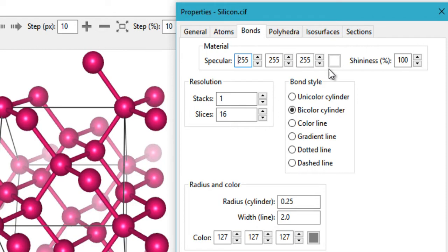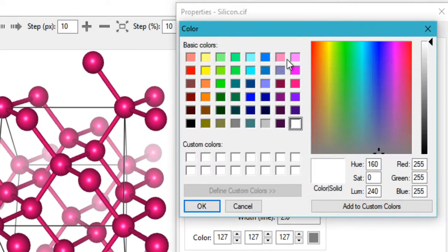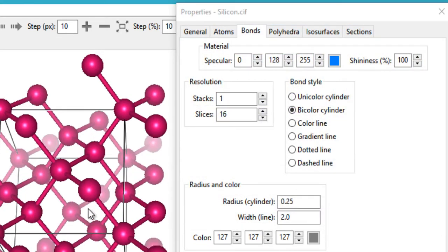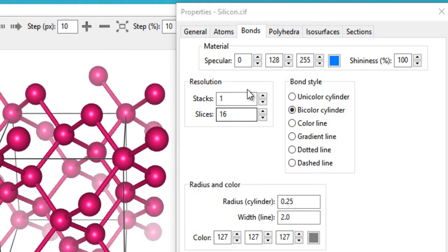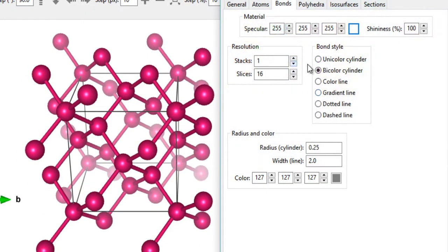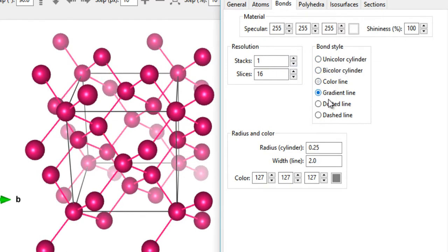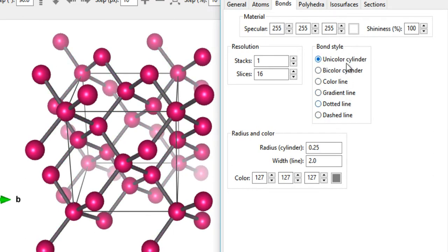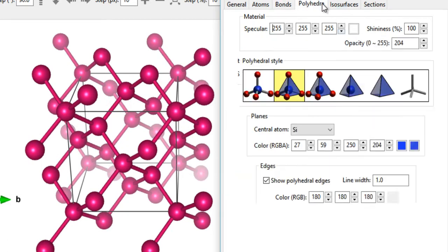Under Bonds, you can change the curve or style of the bonds. I prefer the bicolor cylinder over the unicolor cylinder, so I stick with that. You can also choose the radius and width of the bonds. There are also various polyhedra styles available.